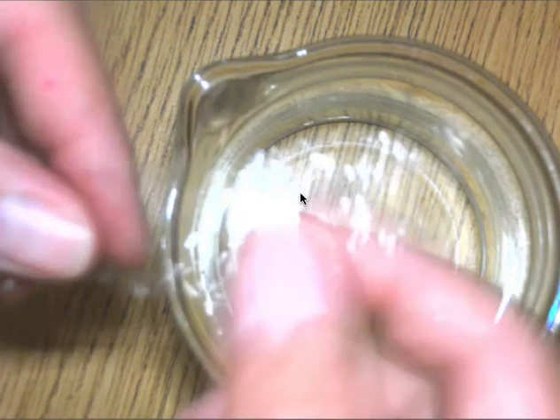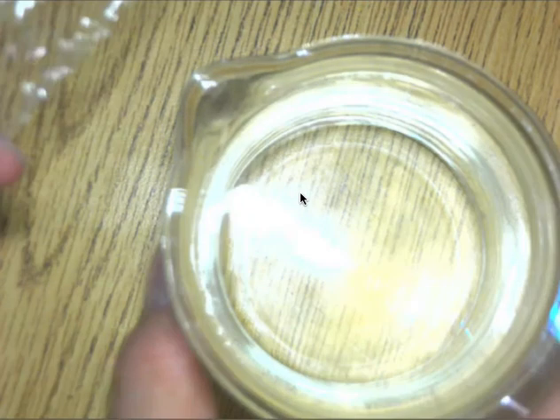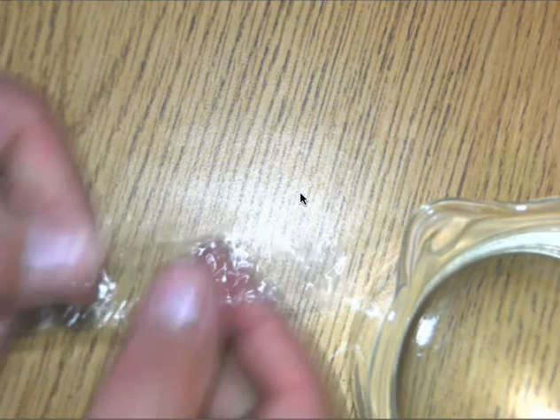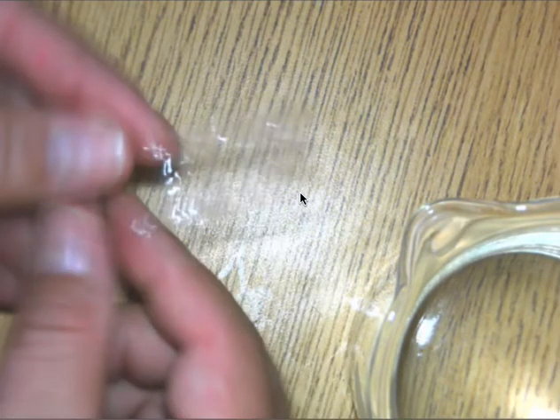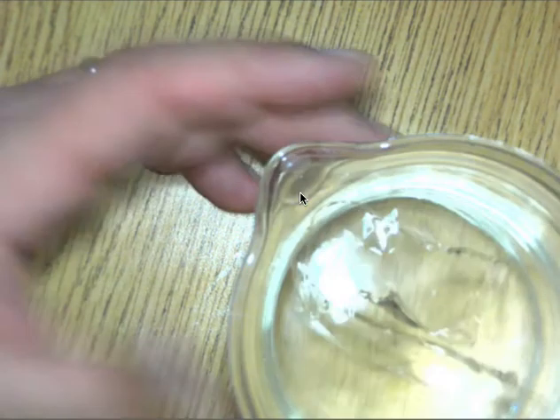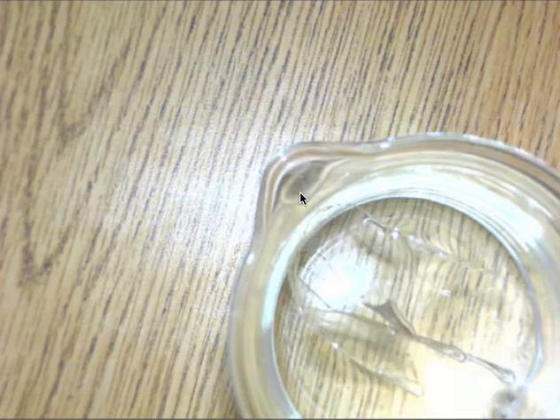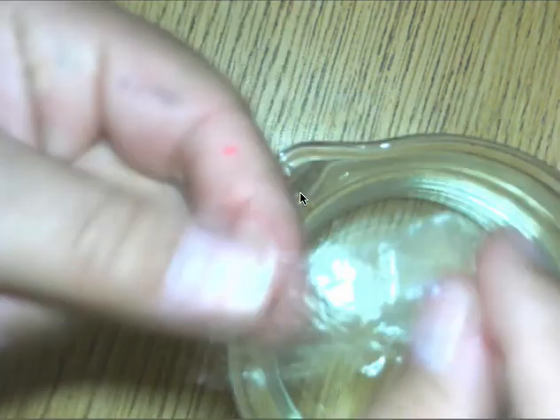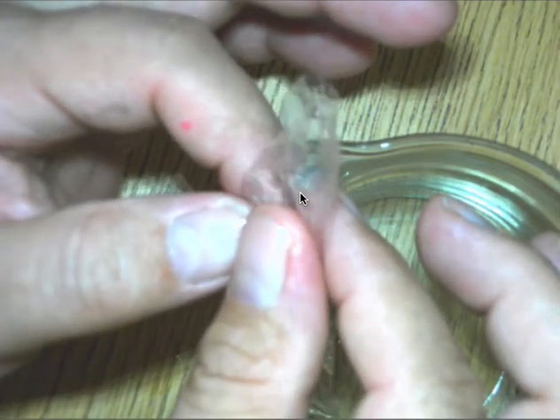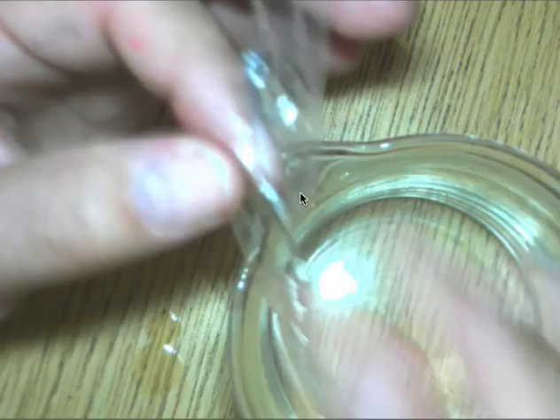So if we take a look here, here's our dialysis tubing. It's kind of crinkly. So we're going to dip it into the water. Wait for a couple seconds. Take it out, and all of a sudden, it's very malleable. Then it says roll it in between your fingers. I don't know if you can see this. See, it has started to open up now.